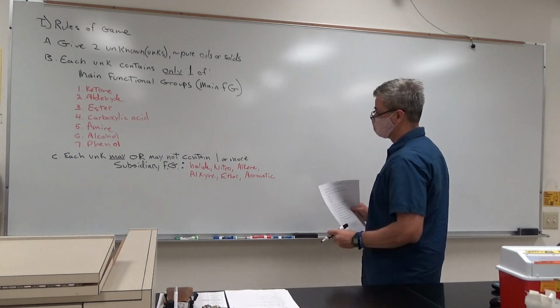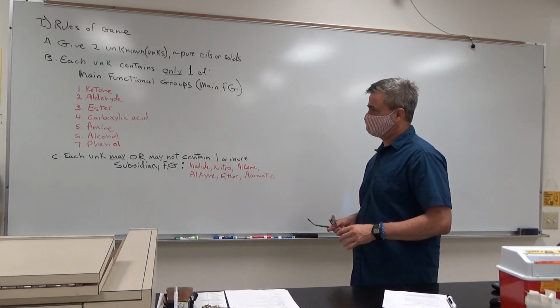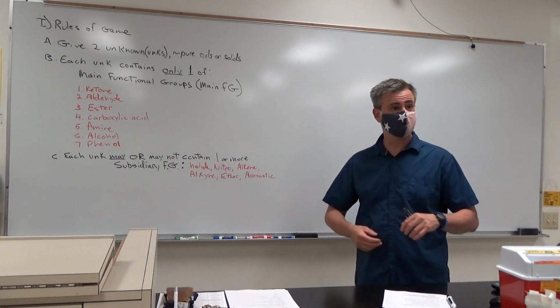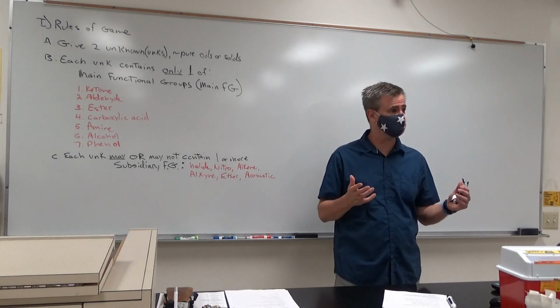Okay. So how are we going to figure this out? There's a few different ways. You're going to do some initial physical tests. What does it look like? Those things are fairly consistent.